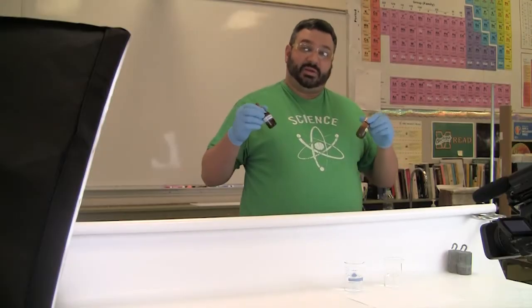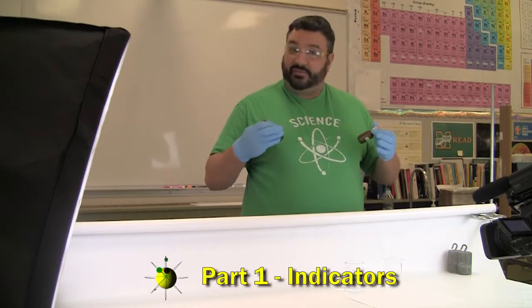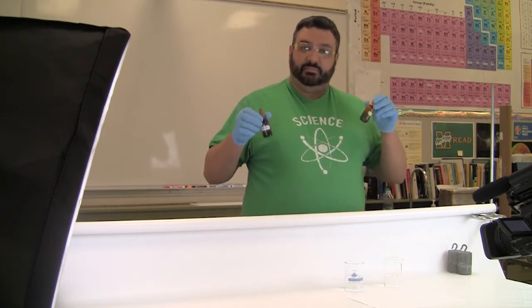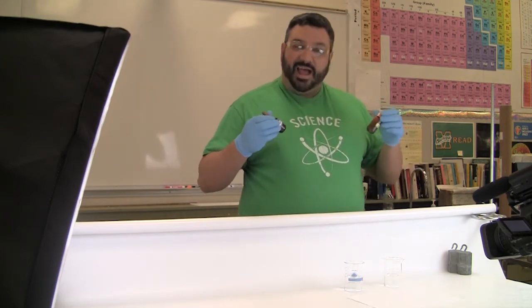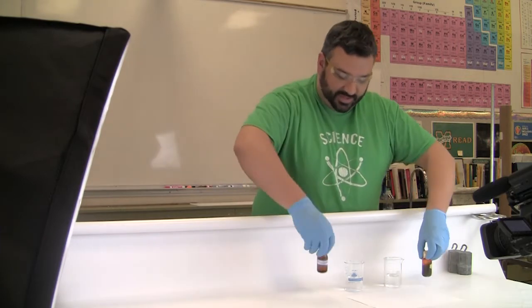Alright, so today we're going to be talking about some acids and bases and a bunch of chemical reactions that could affect the pH of things. So we just wanted to give you a little, pardon the pun, buffer on acids and bases to show you what different indicators do in different things.